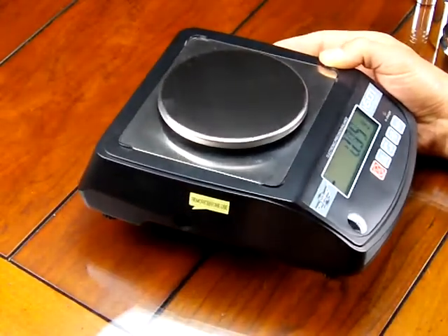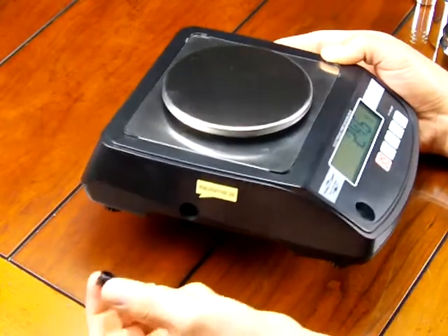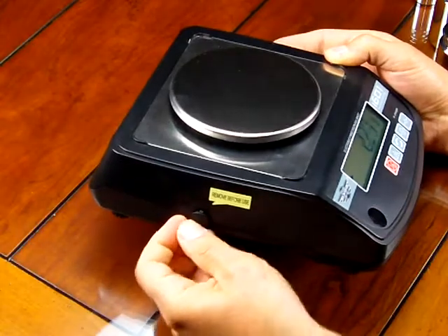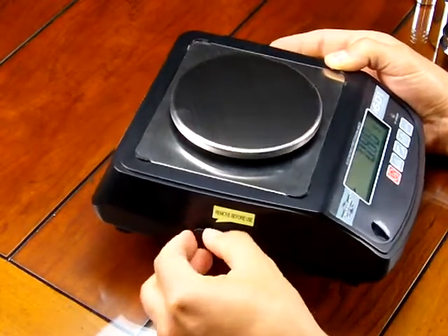So the pin comes out, you just unscrew the pin, and then you have a cap here. This cap is placed on the side of the scale so nothing gets in, and that's how that works. This just presses in.